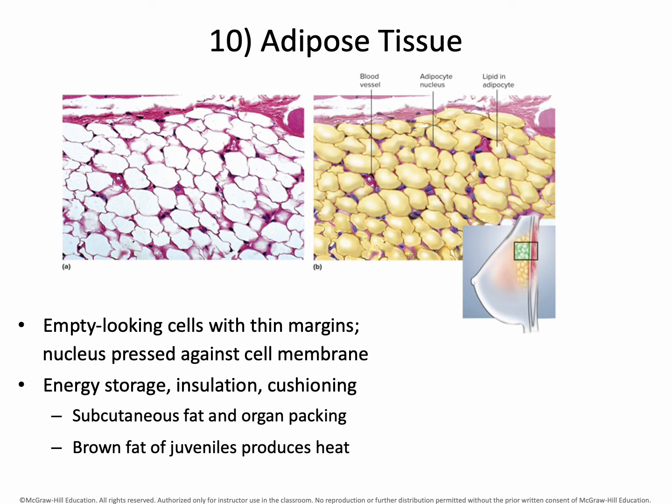Adipose tissue, again, large vacuoles of fat define these cells. The nuclei and the contents of the cells are pushed to the periphery. The fat usually does not take up stain, so you're left with something looking like lace, this open area where the fat vacuole was, and the contents of the cell picking up stain on the periphery of that vacuole. Again, adipose tissue, you'll see that spread out all throughout the body in different areas.